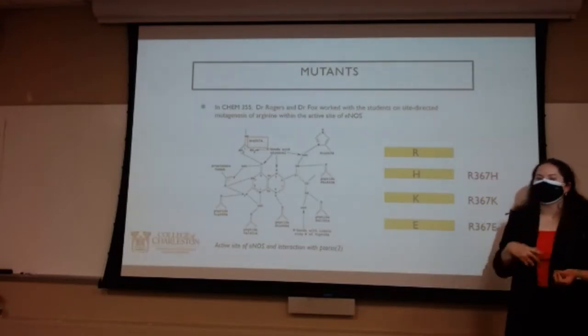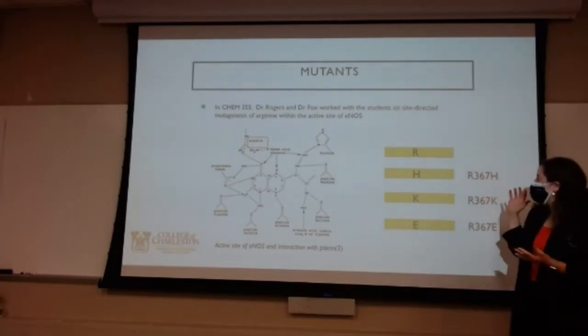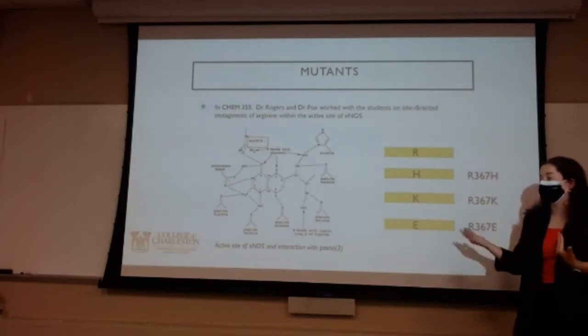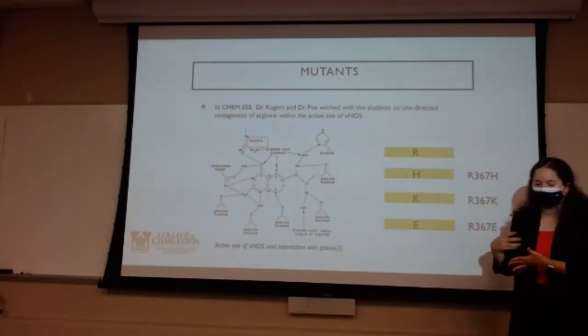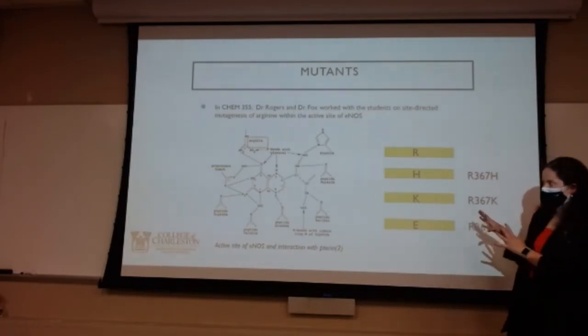So this was the process of actually changing the active site of the protein itself. I have access to 3 different mutants of the protein, which we work on growing, and then apply to these different assay techniques to see whether the protein can still work if you change this 1 piece of the structure.